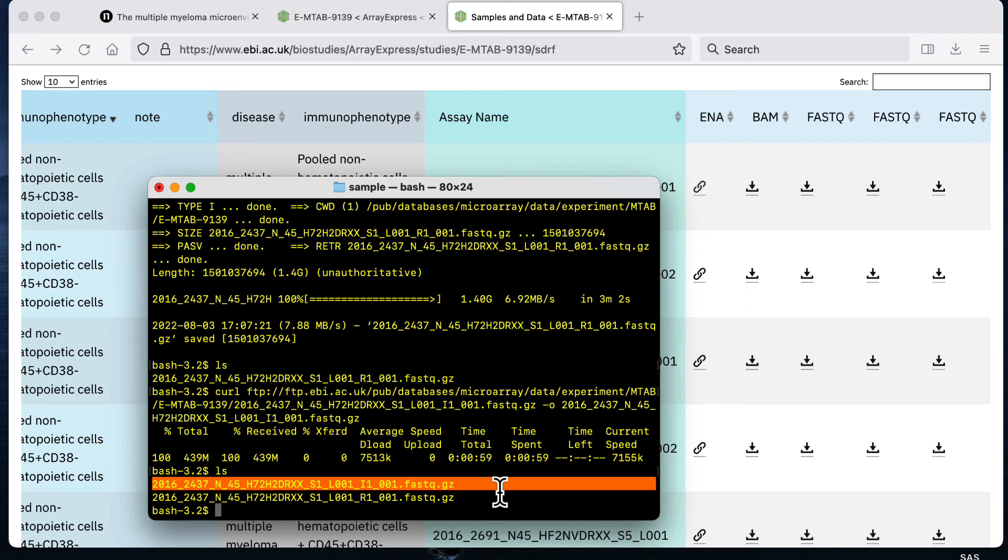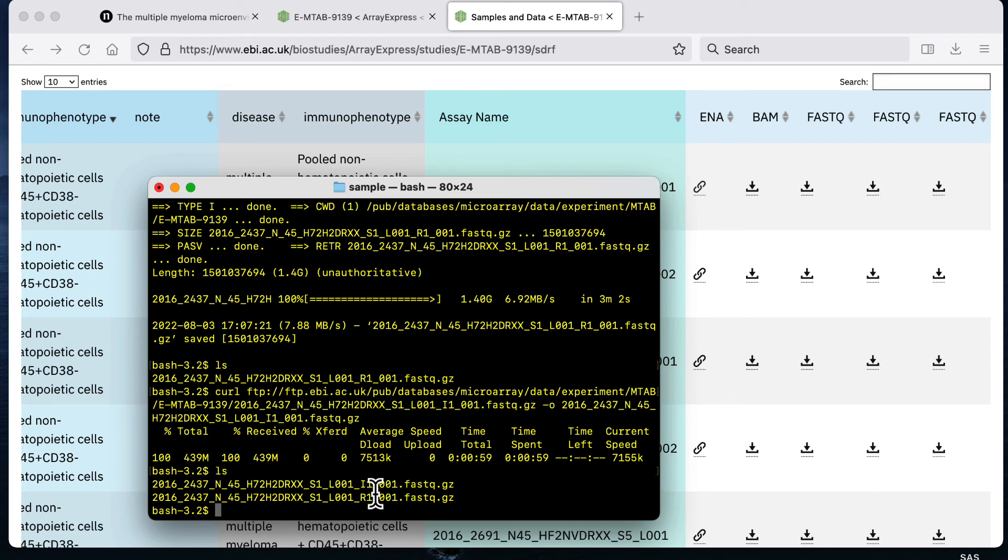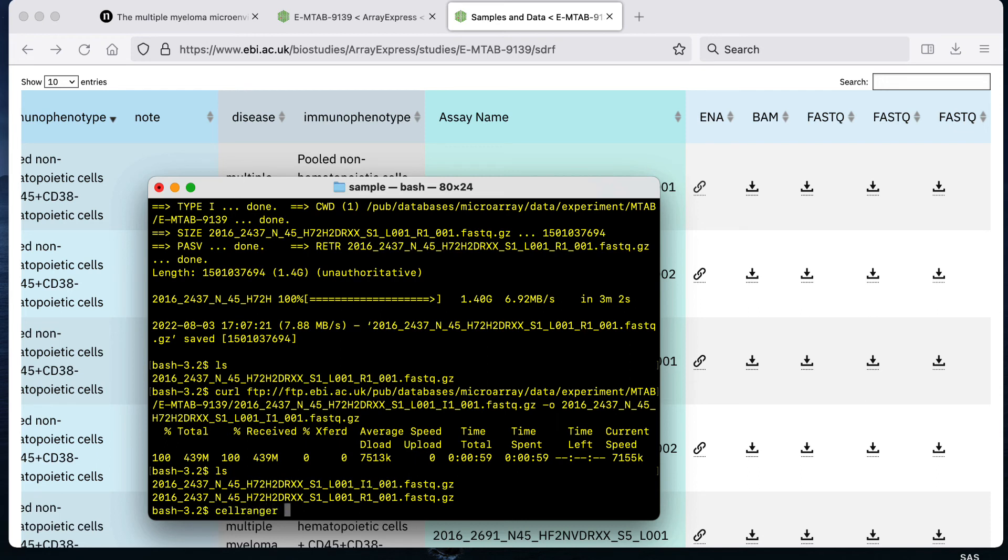That was the second example that I showed. Once you have the three files per subject, so if you have the r1, r2, and i1 files, then you can use those fastq files as input. That's raw data from single cell RNA-seq analysis that you can use as input to the command cell ranger count and then that would do your read alignment step.